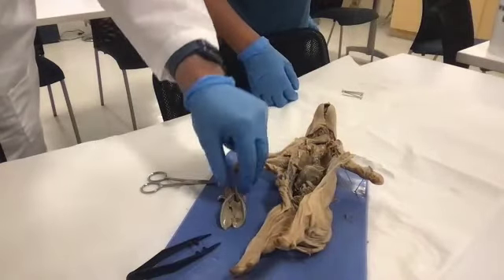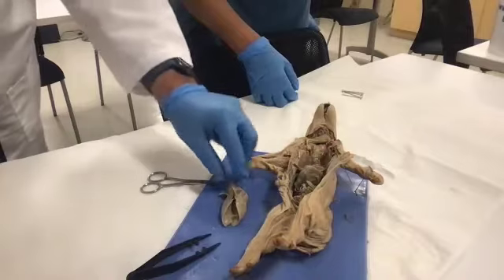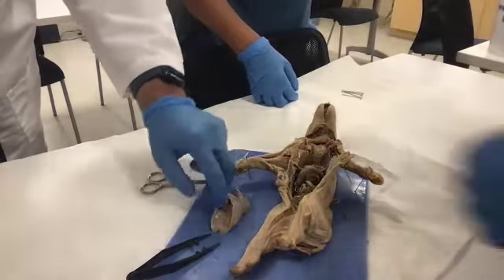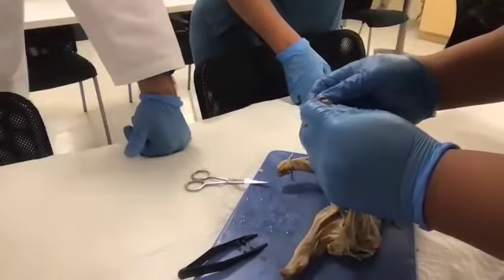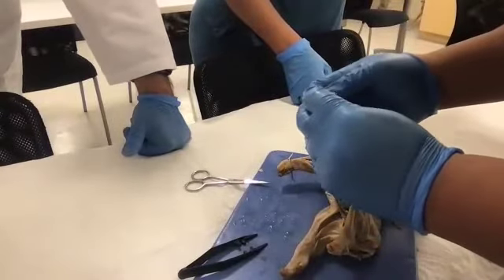It's soft, it's spongy. Then the heart feels hard, like a muscle. And that's what it is. Now we already identified the apex and the great vessels up top. You could also see how.